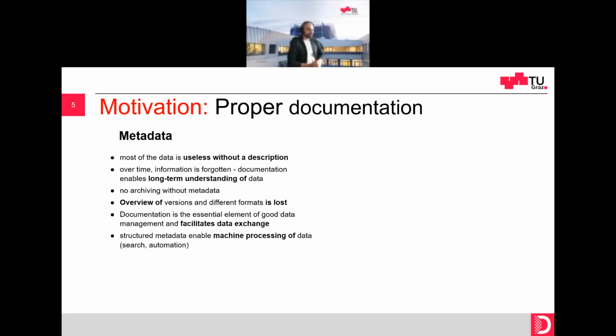Also, when you want to go in the direction of machine processing, machine learning, automation, having the ability to search for things is very important. Structure your data, give it appropriate metadata, and then you can go in this direction as well. Unfortunately, this can be a repetitive activity.